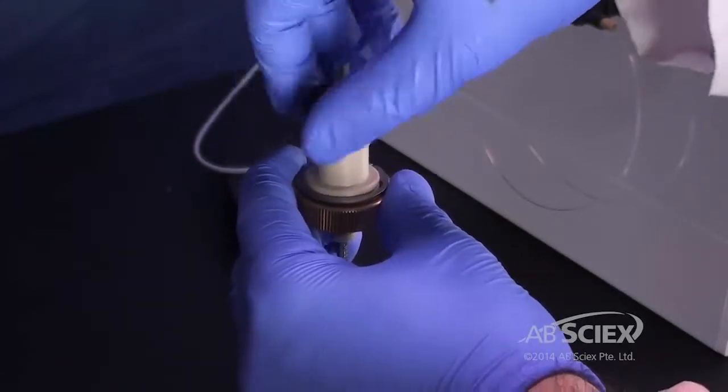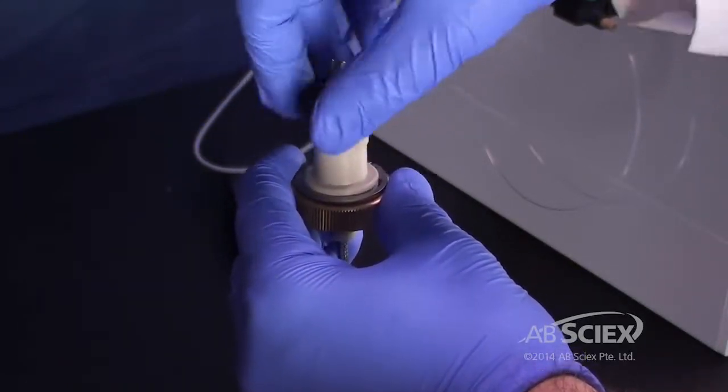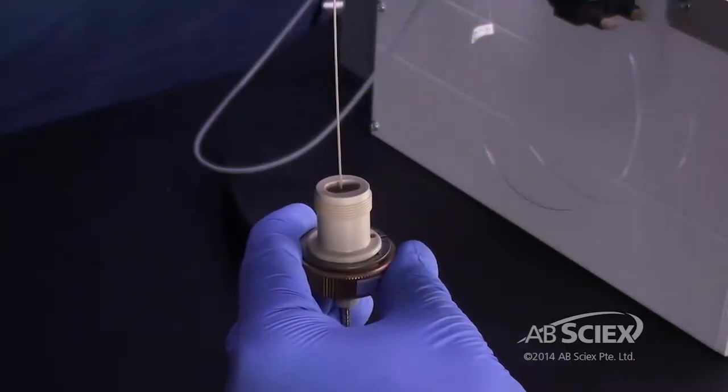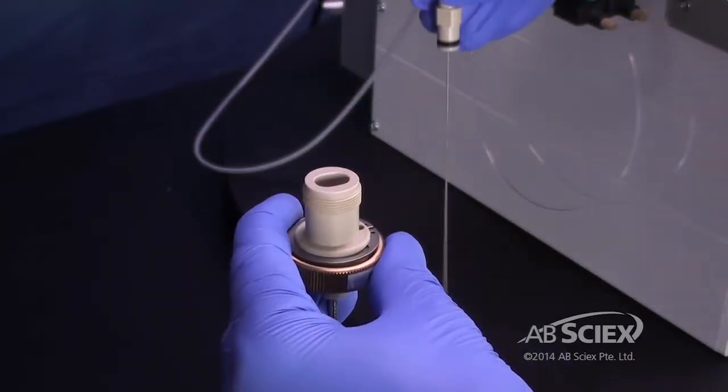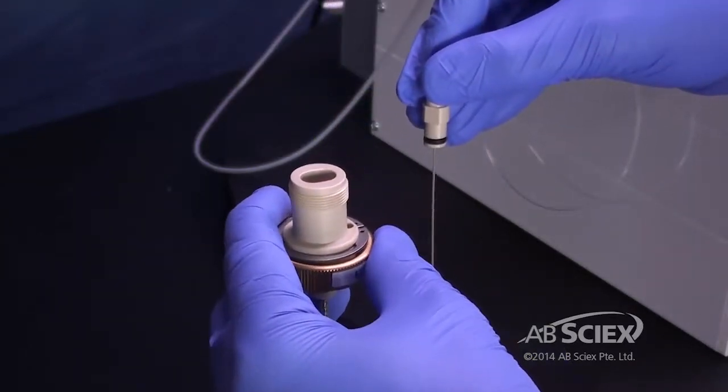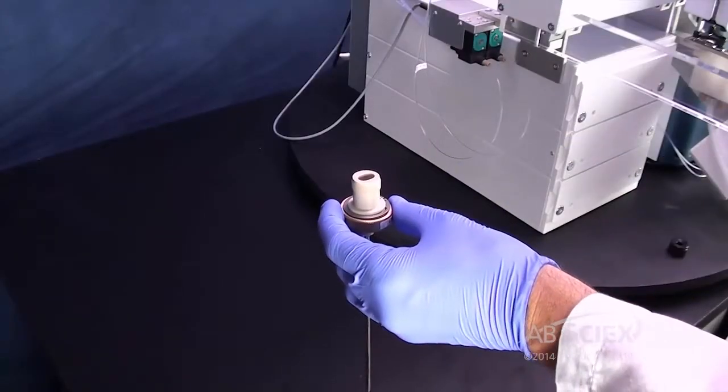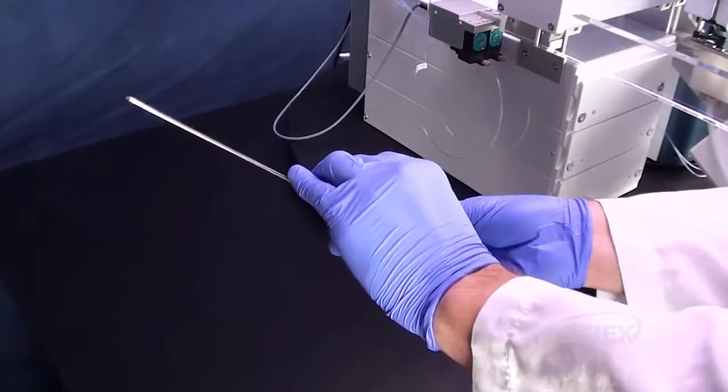Remove the black electrode adjustment cap and holding the probe with the tip pointing downwards, pull the electrode from the probe. Holding the probe downwards will prevent the internal spring from falling out.